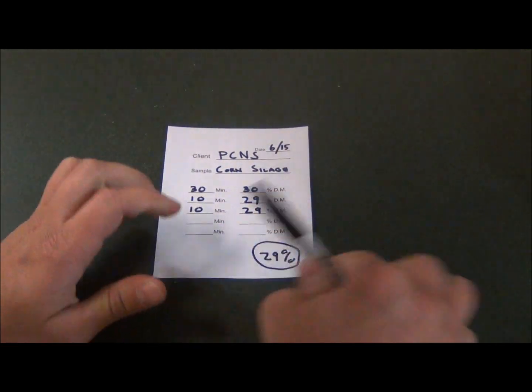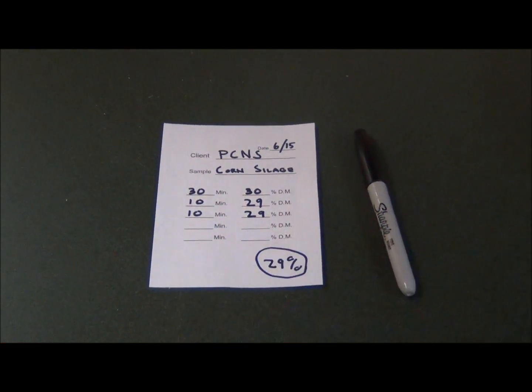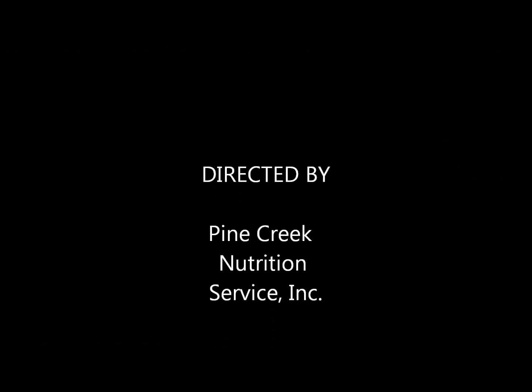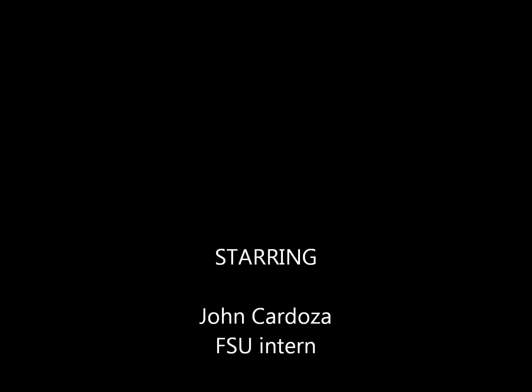It has been determined that the corn silage sample in this demonstration is 29% dry matter. On behalf of Pine Creek Nutrition Service, thank you for viewing our instructional video on determining dry matter of wet feeds by utilizing a COSTER tester.